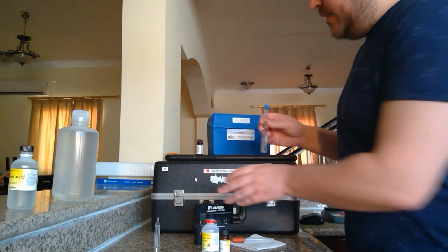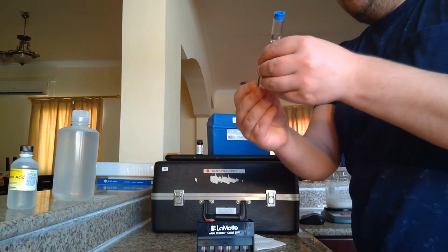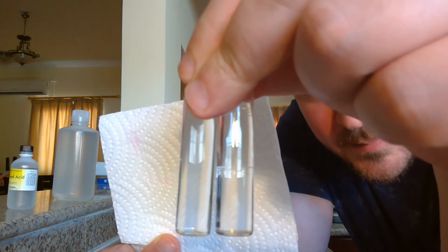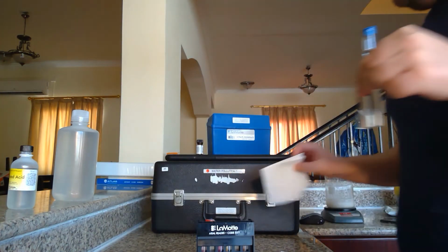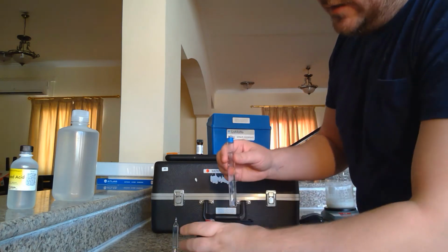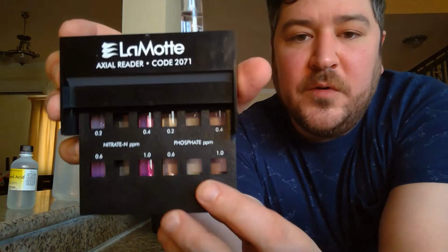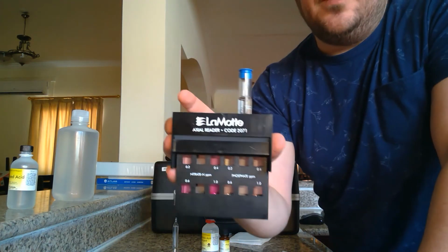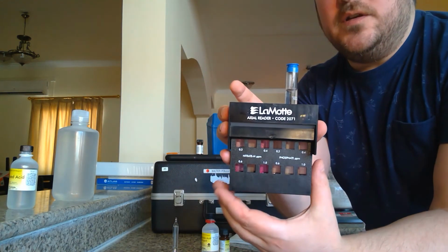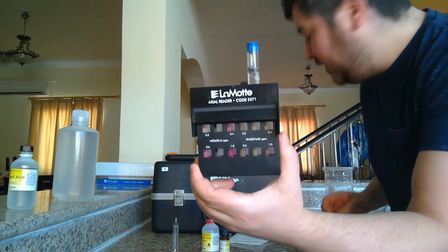Well, it's been 5 minutes, and this isn't nearly as exciting as the nitrate test. I didn't see much of a color change. So you can see this with the sample of water, like the standard sample, and then the sample of ocean or Corniche water. Now I will, of course, put it into the reader. I'm going to use the other side of the reader. Okay, so I'm using this side now, and let me stand up and look at it. I'm not seeing much of a difference. Let me move in the kitchen here, see if I can get a different light and see if it's closer to one of these results.